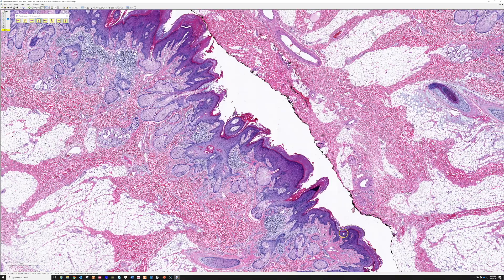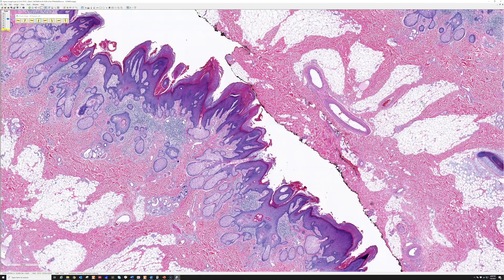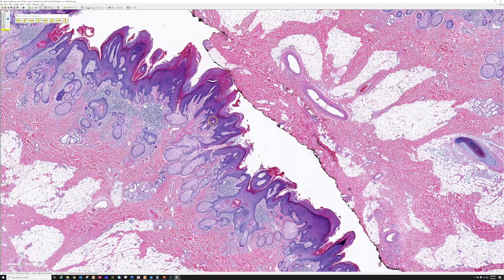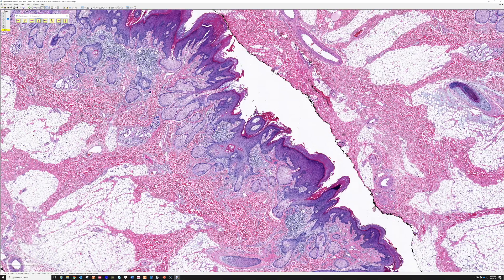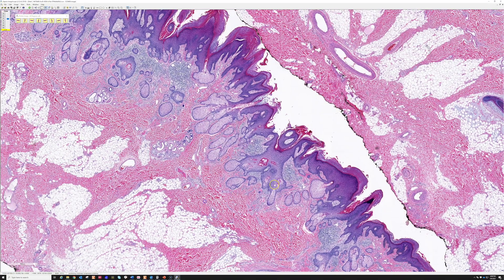Not only that, but the epidermis becomes undulating and papillomatous. Here it really resembles a wart or a verruca, and sometimes it can resemble seborrheic keratosis. So we have epidermal acanthosis and papillomatosis looking like either a verruca or a seborrheic keratosis — that's point number one.